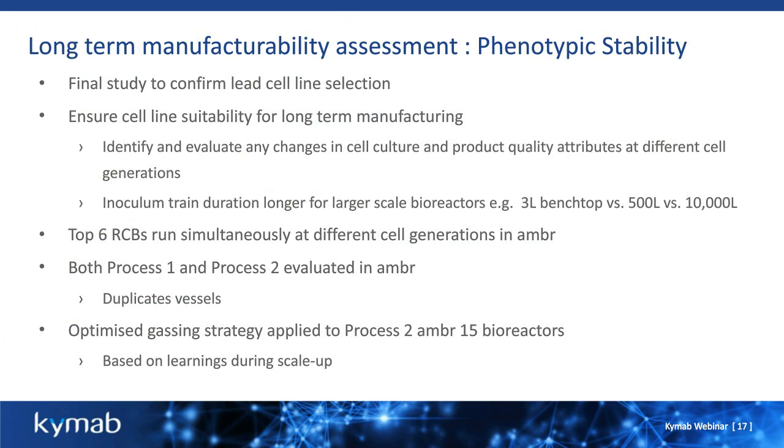The final study undertaken during the cell line selection campaign was a long-term manufacturability assessment, also known as the phenotypic stability study. This study aimed to ensure cell line suitability for long-term manufacturing by identifying and evaluating any changes in cell culture and product quality attributes at different cell generations.